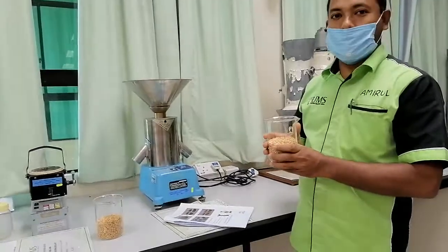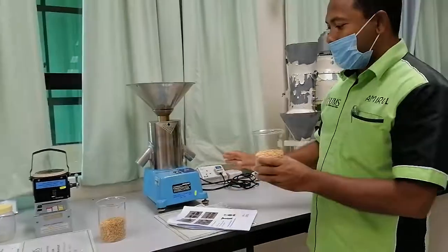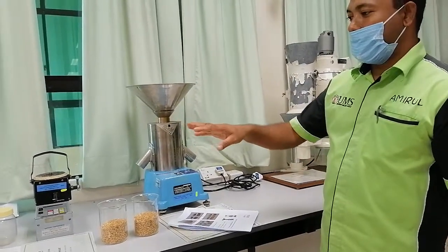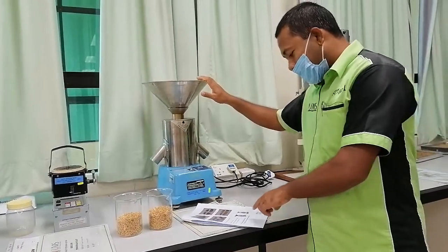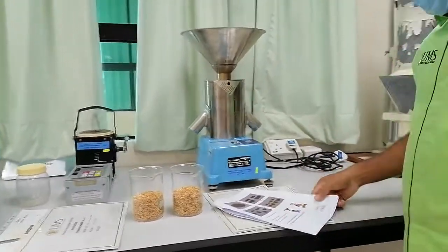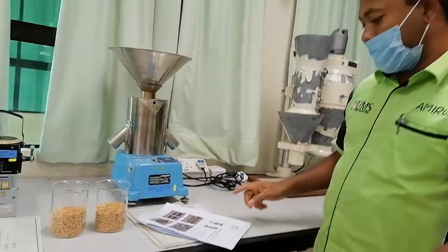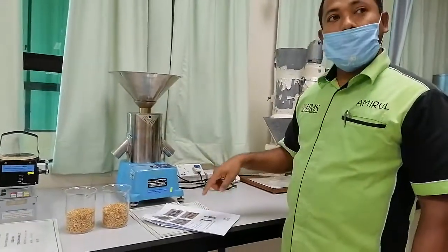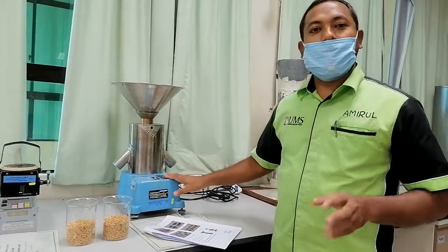This is mostly accurate because this is a commercial machine, so we can depend on it. This is the seed divider, and other machines I will show later because it is based on seed quality. We have another machine — during our practical this afternoon I will show. One is the Boerner type. This one is available in the main seed laboratory. Later by video I will show you that one. So this one is the electrical seed divider.